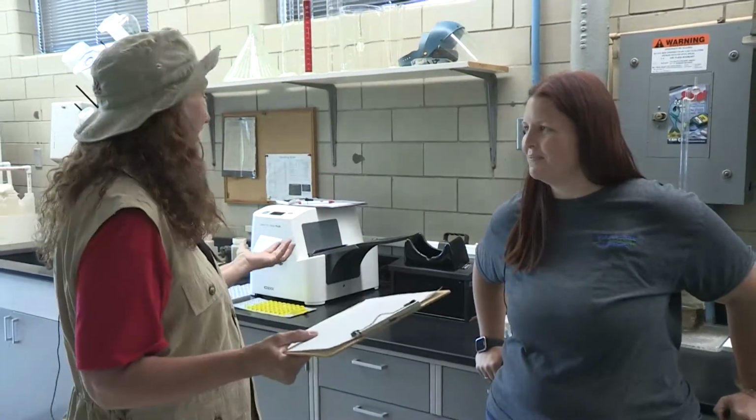Now, Aaron, wastewater is something we don't want very much of, do we? Correct. And you are in a lab here that just has lots of things in it. Can you tell us what you do here? Sure. So we take all the water that comes in from people's drains, their showers, the toilets, anything that you guys flush down into the sewer system, and it comes into our wastewater treatment plant, and then we treat it. So it goes through a bunch of processes outside, and eventually we return it back to the river. So in here, we do all our testing to make sure that the water is clean enough so that we can pass and go back to the river.